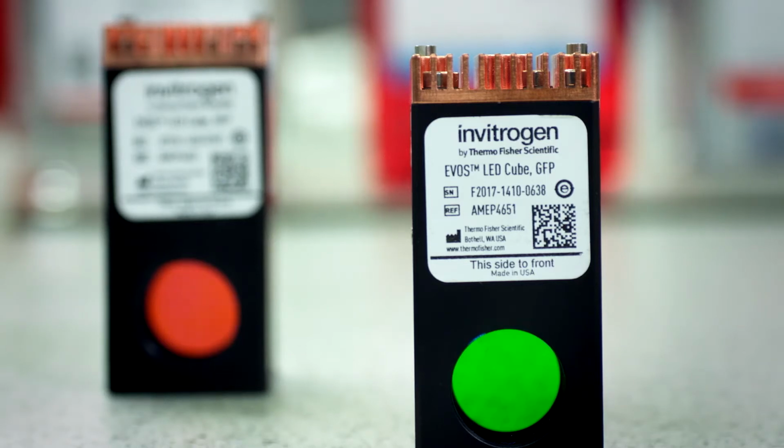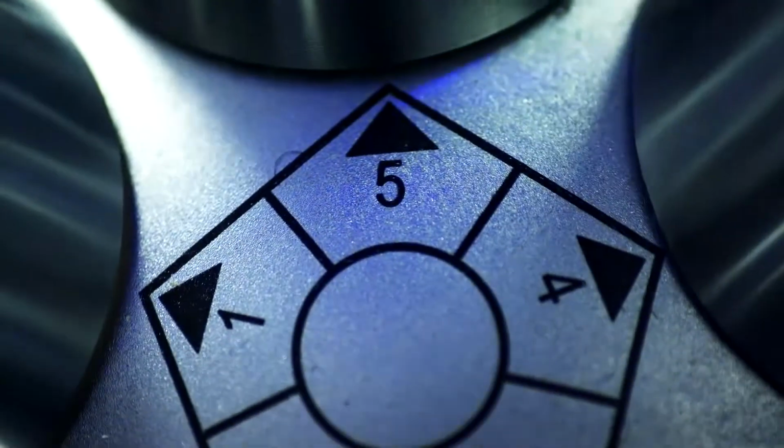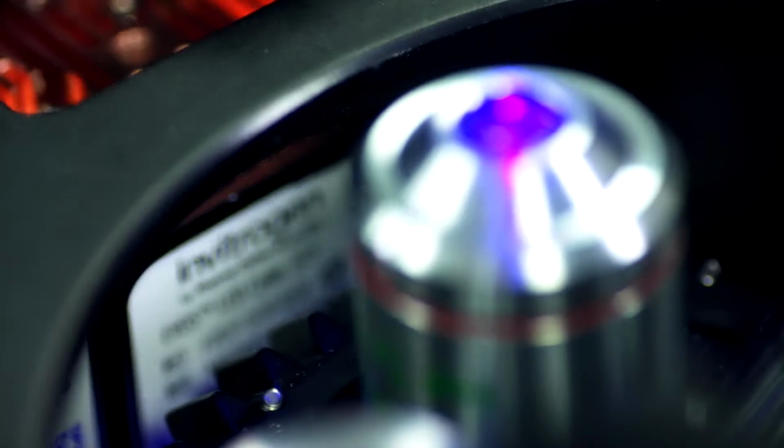Another part is the fluorescence imaging. I usually try out live cell imaging, at least on 5 different day points, and I use those images to monitor my progress. It then makes it easier to report when you're talking to colleagues or your superiors about your research.